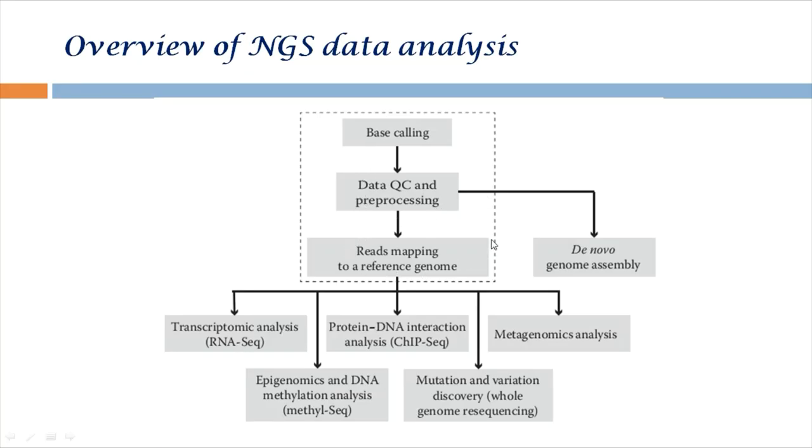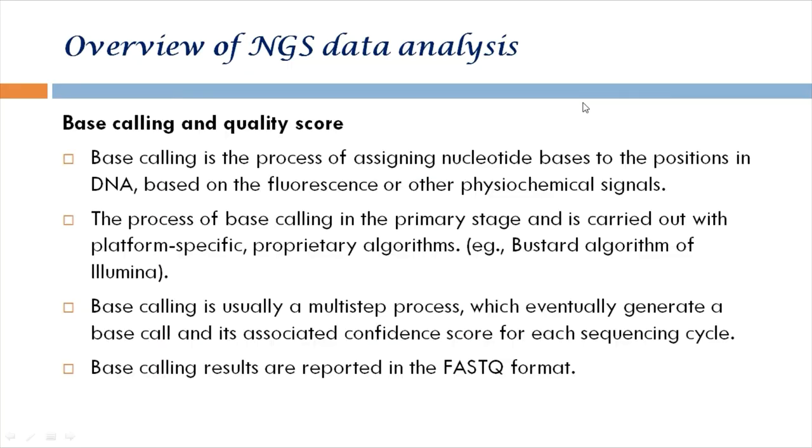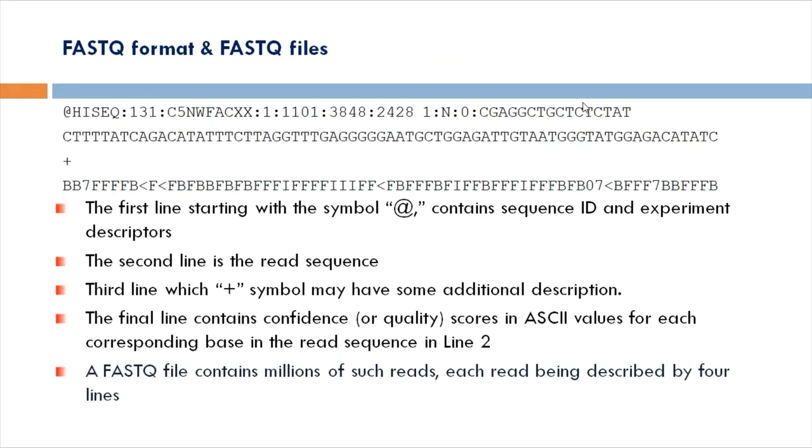Followed by that, you'll have to do an alignment procedure. Why you should do an alignment, I explained before. How to do that, you'll see in the coming slides. Once this is done, there are several applications for NGS technology. All right, so this is what I explained about base calling and quality score.